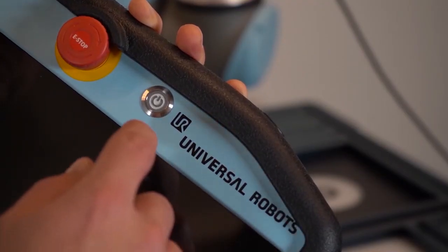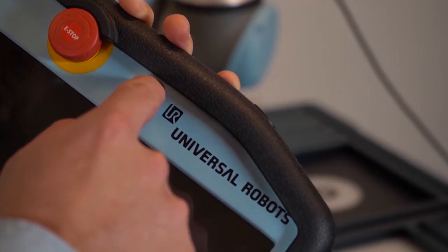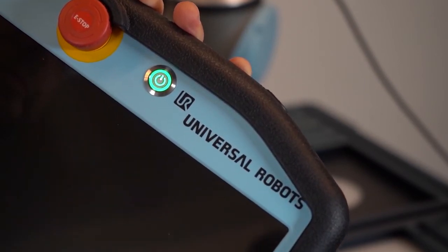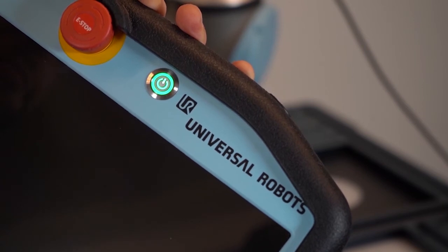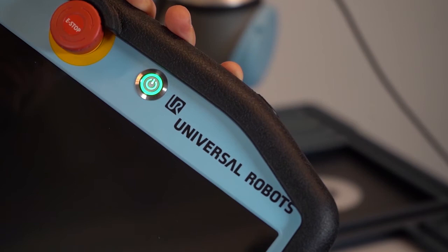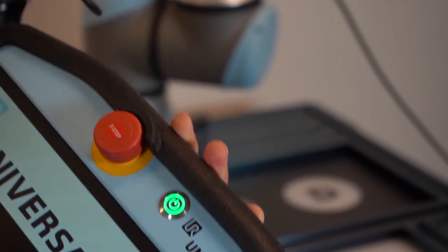Power on the robot. From this point on, the USB storage device containing the Vision Server must not be unplugged. It acts as a memory expansion for the Vision System. Please refer to the instruction manual of the wrist camera for updating or removing the software.